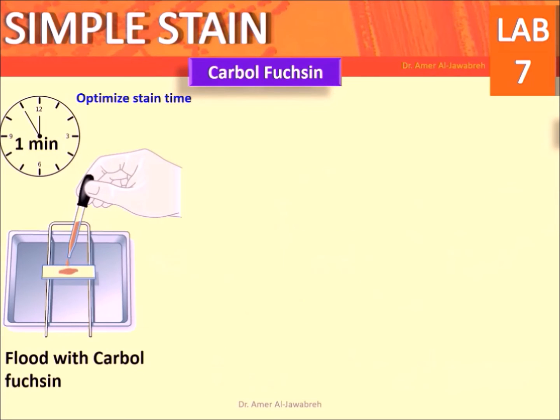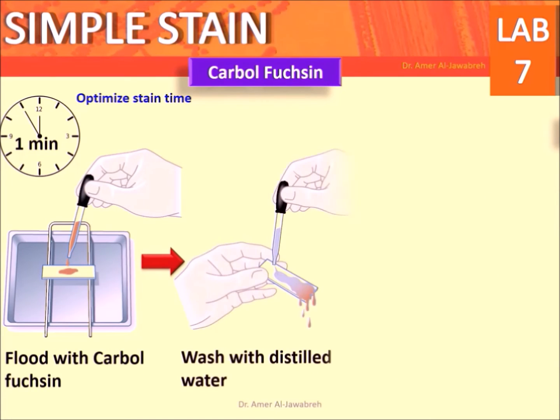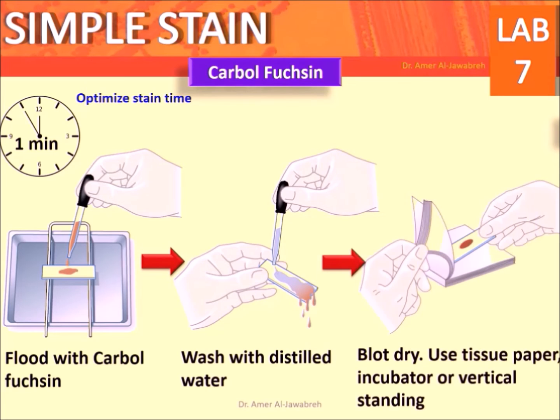Carbol fuchsin procedure: flood with carbol fuchsin for one minute. Wash with distilled water. Blot dry using tissue paper, an incubator, or by vertical standing.